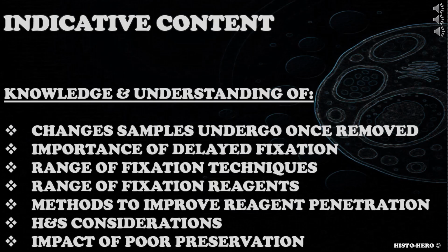Why would tissue fixation be delayed? What circumstances would require delayed fixation? Consider logistics, frozen section, genetic analysis, antigen preservation, biobanking, specimen size.